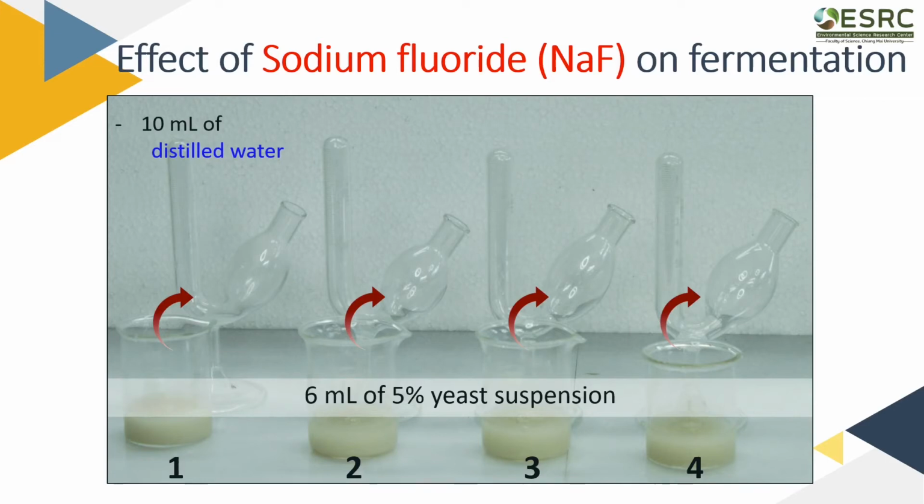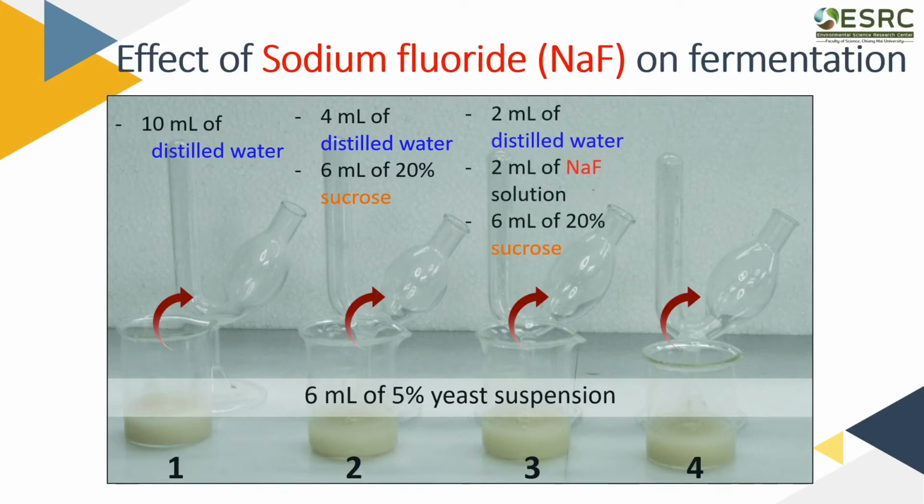The first tube was mixed with distilled water. The second tube was mixed with distilled water and sucrose solution. The third tube was mixed with distilled water, sodium fluoride solution, and sucrose solution. And the fourth one was a mixture of sodium fluoride solution and sucrose solution.